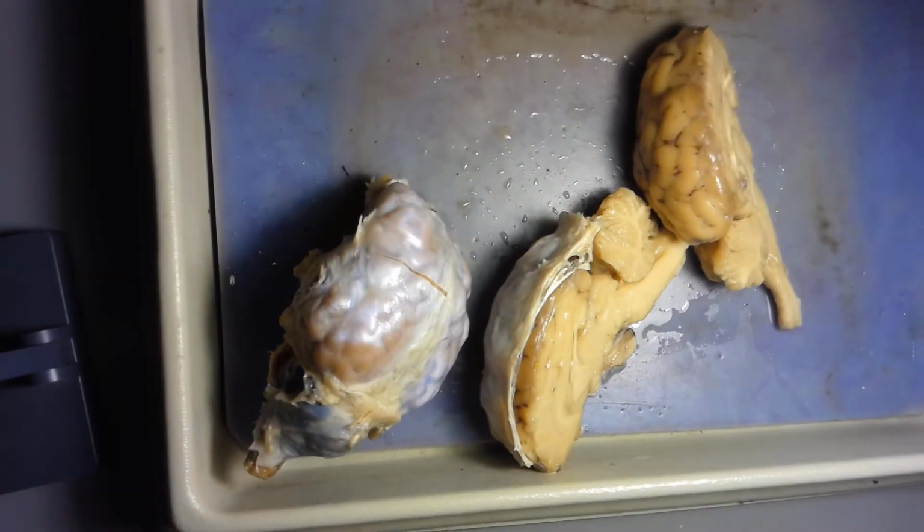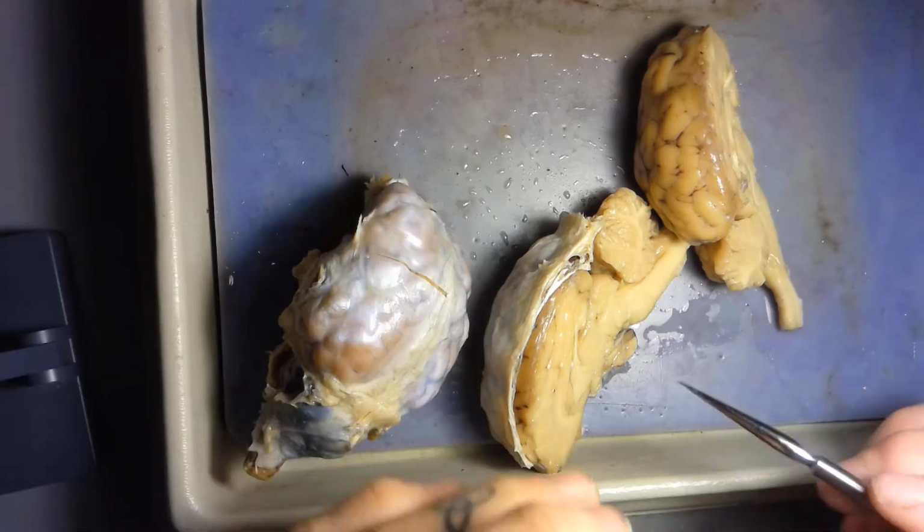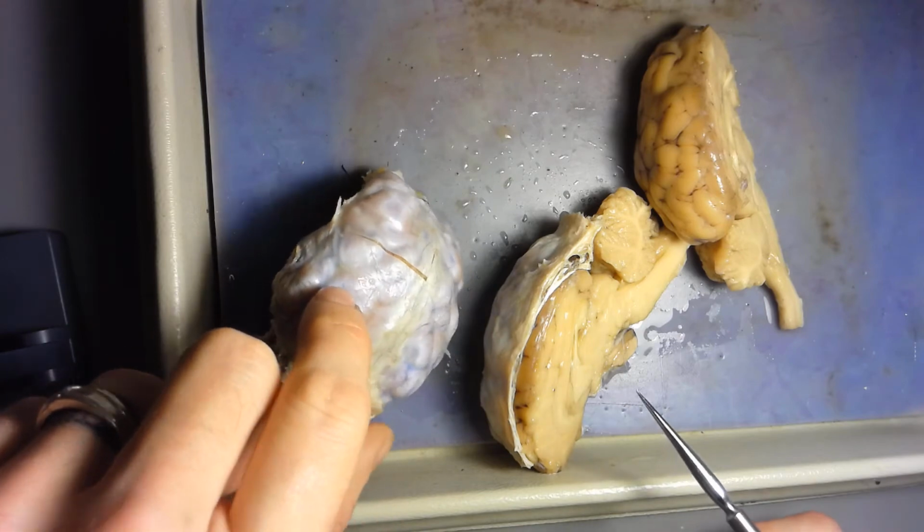So I'm going to bring up the real brain now. Take a look at different images of this real brain. I'm going to go back to the list here and show you the different parts of that with the actual brain now. Some things you can see really well on this sheep brain, some things you can't. If you can't see them that well on the sheep brain, I'm going to be more likely using a model to test you on the parts here.